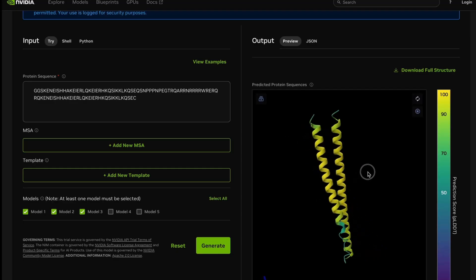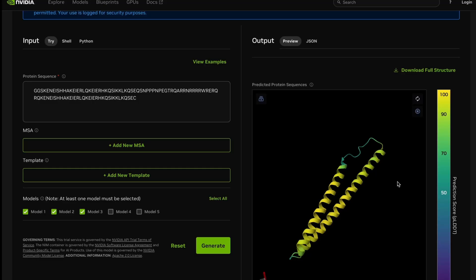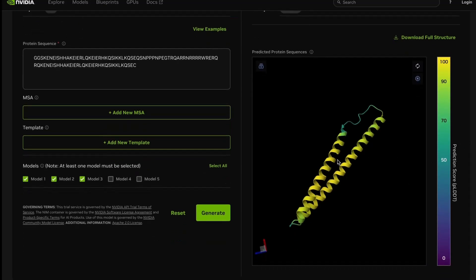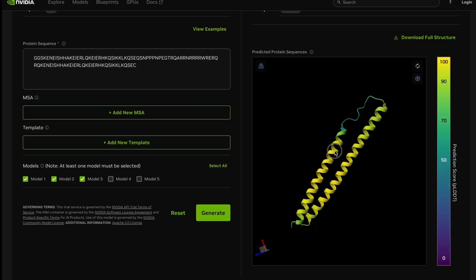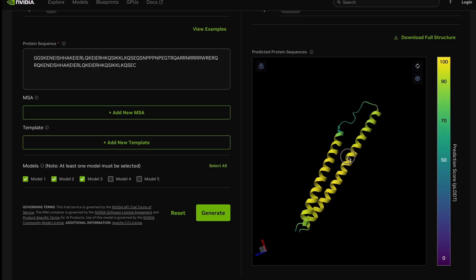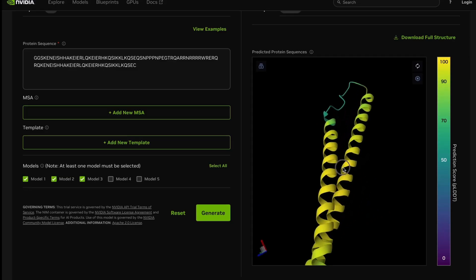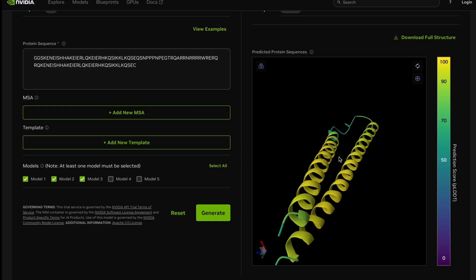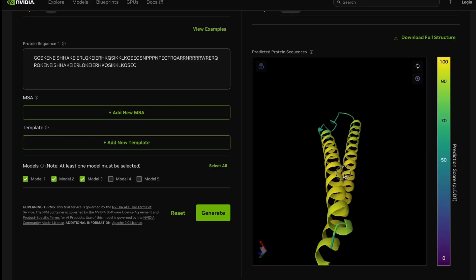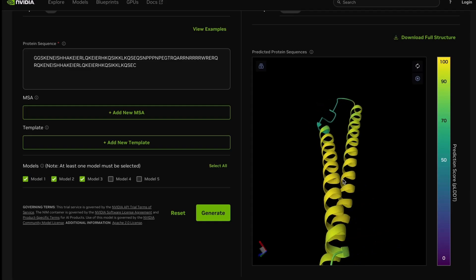Here is the modeled protein. You can see the example and this is a well-modeled protein. How do I know that? You can see the pLDDT score. The pLDDT score is basically a predicted value — if you procure this particular structure using a wet lab experiment and superimpose that structure onto this computationally modeled structure, what are the odds of getting exactly similar folds, like your alpha helices and beta sheets. Here you can see it is higher on the yellow side, meaning there is a 90 to 100 percent chance that if you superimpose this with a wet lab experimentally evaluated structure it will resemble mostly between 90 to 100 percent. You can express it as a value between 0 to 1 or as a percentage.